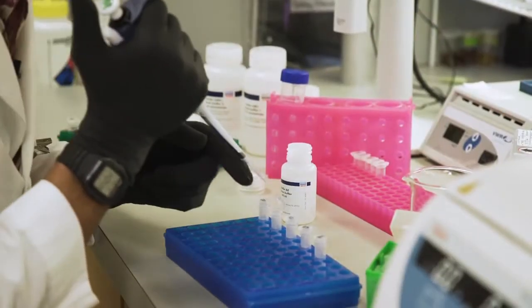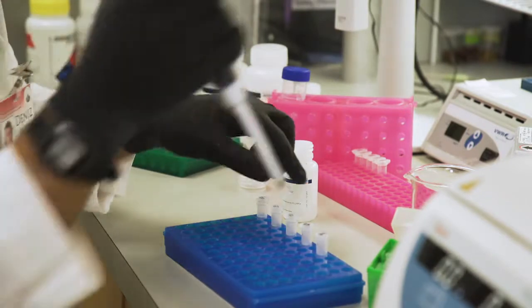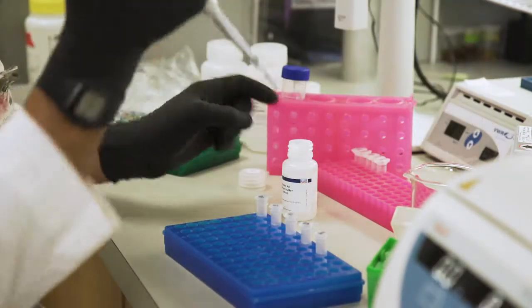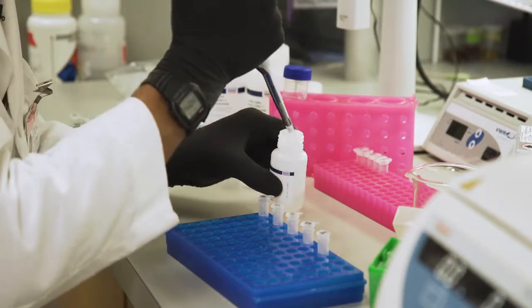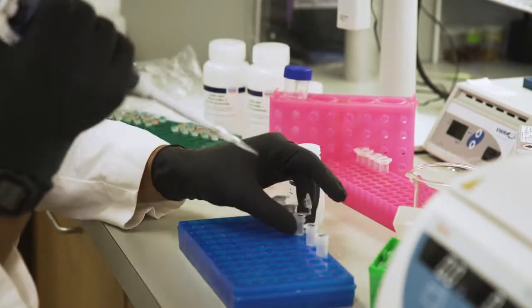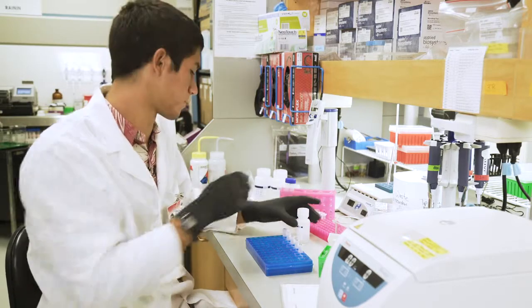The elution buffer, because of the way it works, has to sit right on top of the filter for how many minutes? 5 minutes? 5 minutes. So I'll add it, we'll wait 5 minutes, and then we'll go ahead and centrifuge it. Just make sure that all the DNA that's on the filter gets fully dissolved. That's been added. Check our watch and wait for 5 minutes.